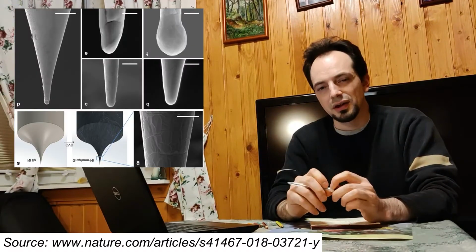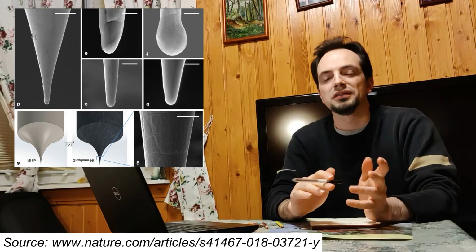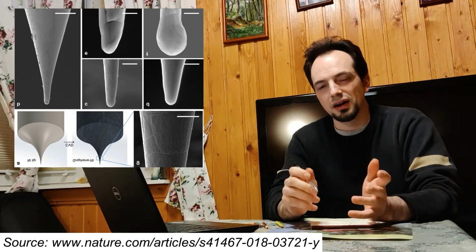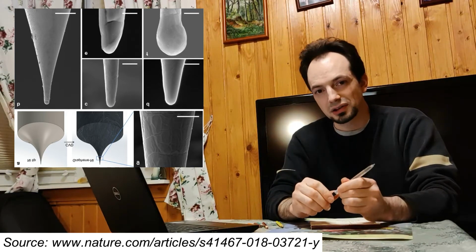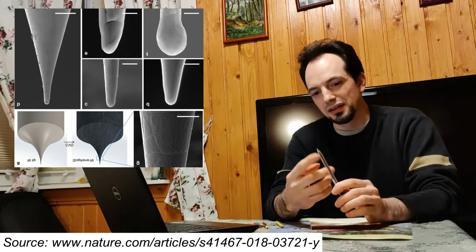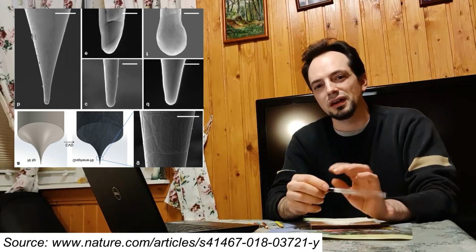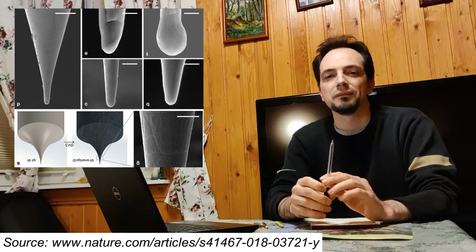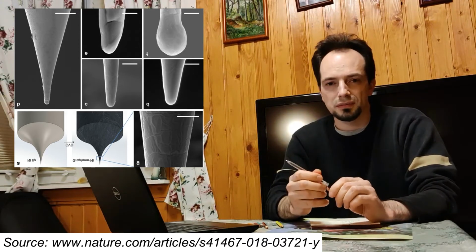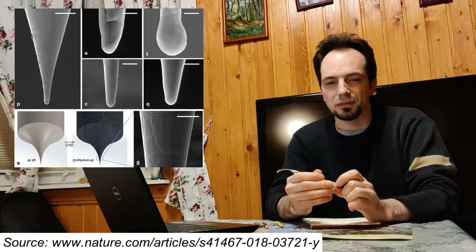The final option is a so-called field emission cathode, which is just a needle, but a very thin one, which emits by means of auto emission in quite a high electric field intensity. If we apply quite high electric field intensity to a very sharp needle, the electrons would start to fly off the tip of the needle, and that's it. No auxiliary heating required in this case. This type of cathode gives the thinnest and narrowest beam, but it has its own drawbacks also. Not the best intensity could be drawn out of this type of cathode.